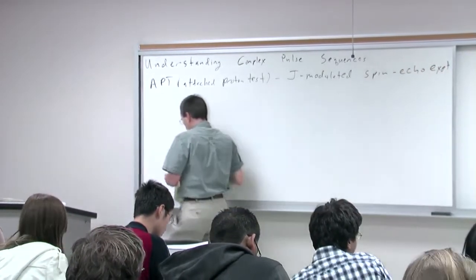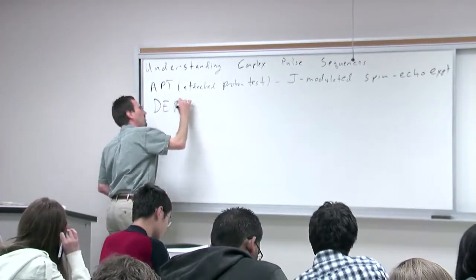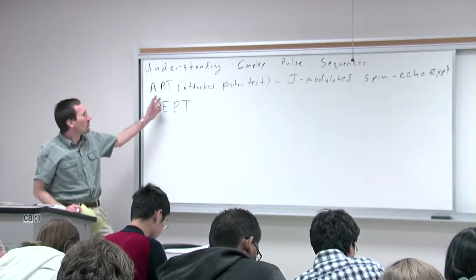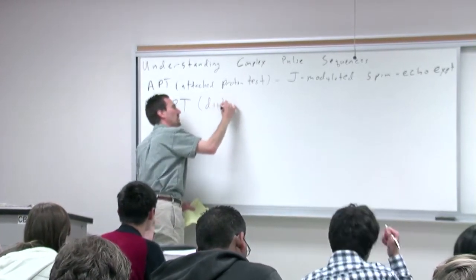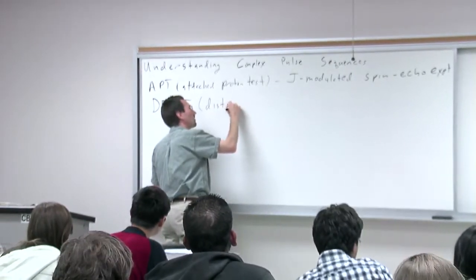And then we'll talk a little bit about DEPT. We won't go and understand it as well, but you'll see how the parameters that we talked about for the APT relate to the DEPT experiment. DEPT, if you don't know, is distortionless enhancement by polarization transfer.